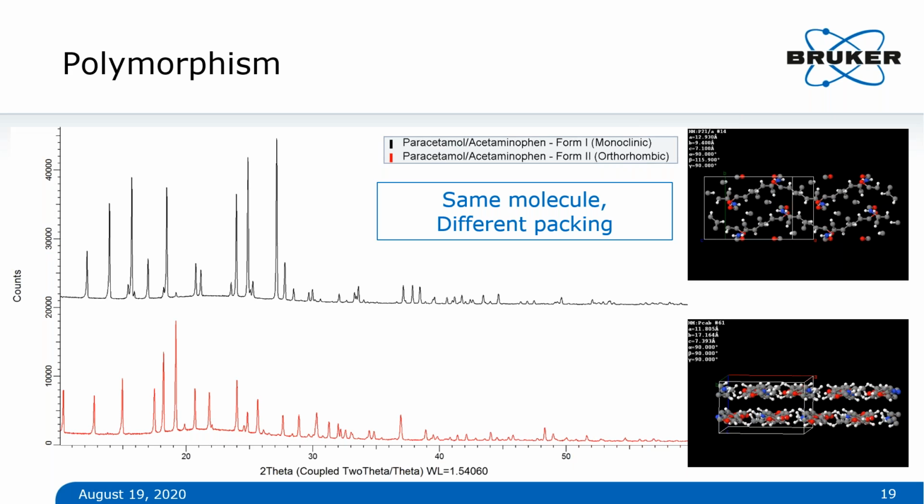You see how the background right there around 20 degrees is not perfectly flat. These samples were actually collected in a capillary, so you get signal from the glass. If you had, say, water or some sort of grease or oil or some liquid, you would expect to see a non-flat background. So some sort of gentle rise, maybe a single hump, maybe two. But then the comparison would be for the API in the wet suspension versus the API dry. Ideally, the peak positions and locations would be exactly the same. The difference would be predominantly in the background.